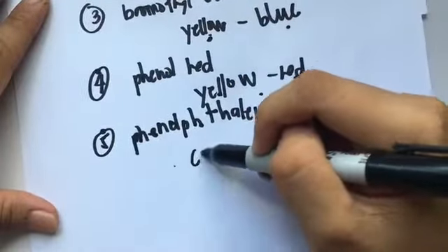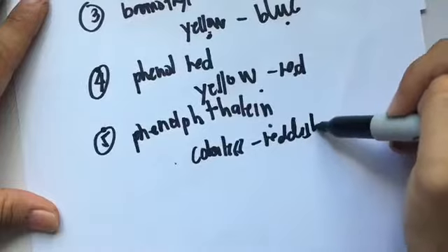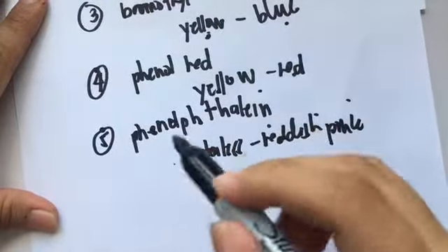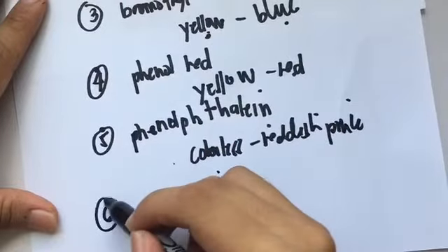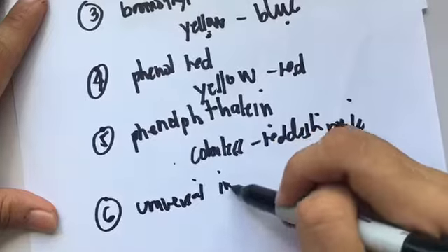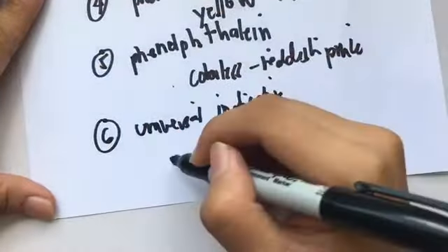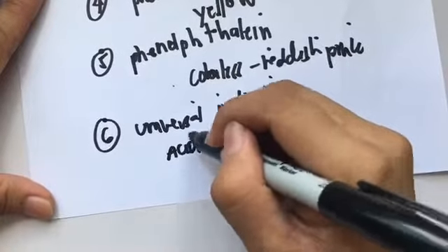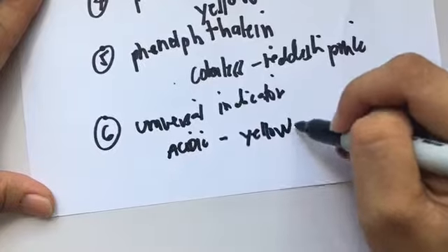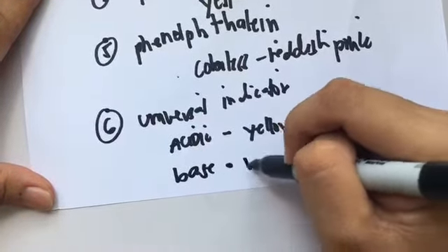Phenolphthalein changes from colorless to reddish pink. This is for acid and this is for base. And last, we'll have the universal indicator. Since the universal indicator is a combination of several indicators, its acidic color range goes from yellow to red, while its base range goes from violet to blue.